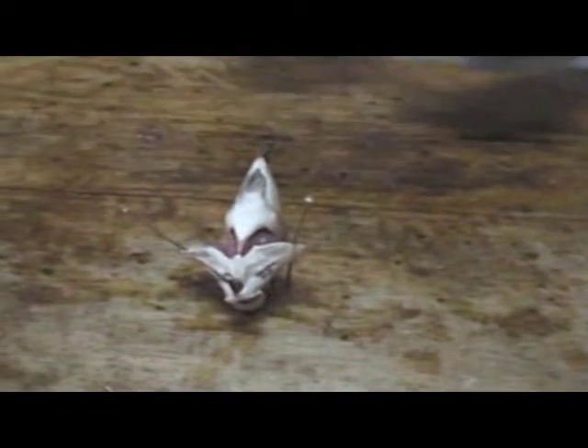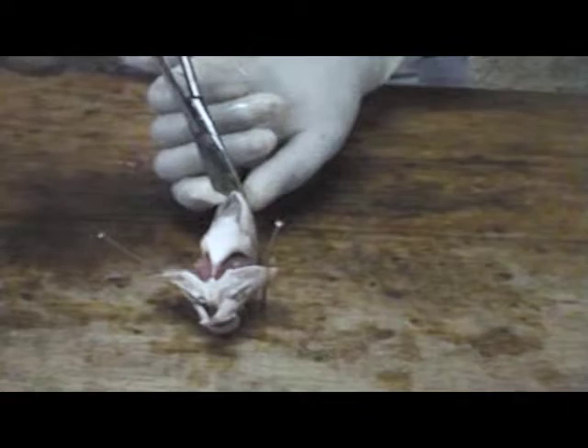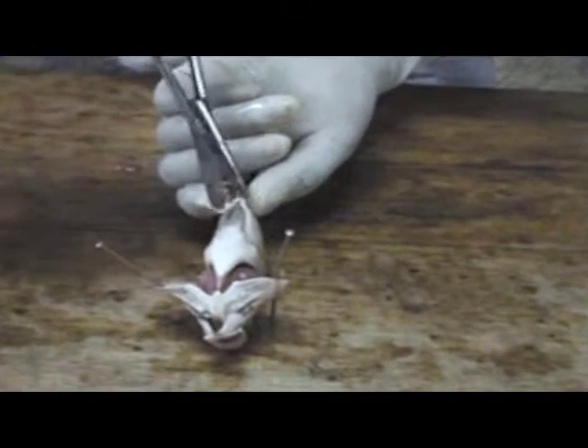We have not looked at this one but we will open it and see inside the text of this one. To dissect the fish, we make an incision just a little bit above the cloaca, we make it laterally like that with our scissors.